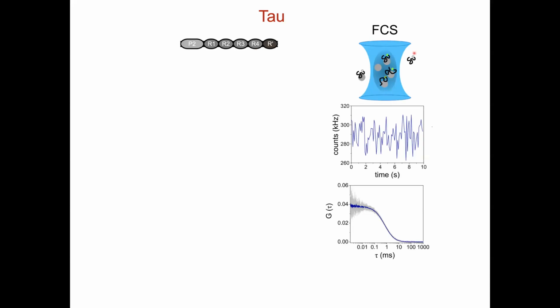Okay, I should give at least a brief overview of FCS in case there are people who are not familiar with the method, even though I imagine a lot of you are. Like many diffusion-based single molecule techniques, at the basis of this method is a highly focused laser beam, which I'm showing in cartoon form here. So you end up with an excitation volume that's on the order of femtoliters. Like a lot of these methods, you're allowing Brownian motion to be your primary driver of changes in signal. So we let our molecules just diffuse through as they normally would due to thermal fluctuations.